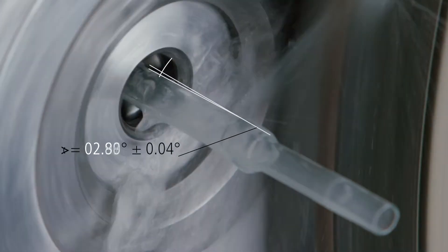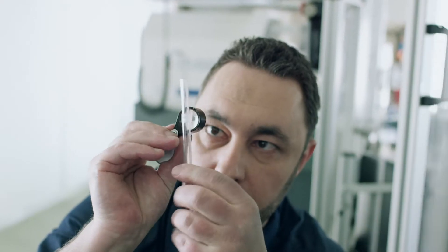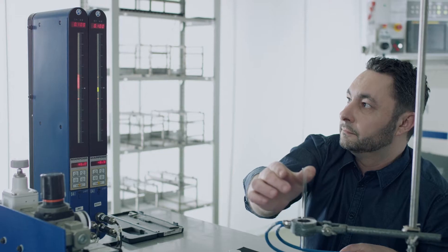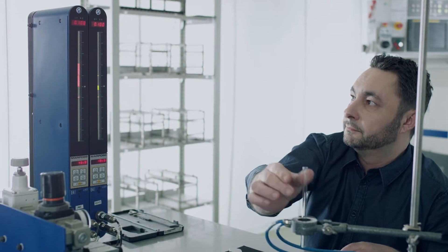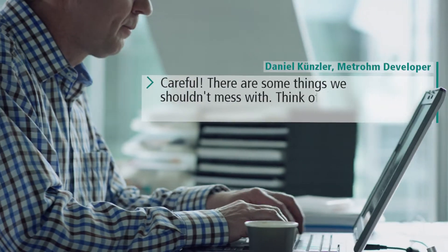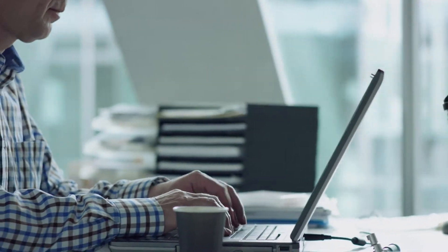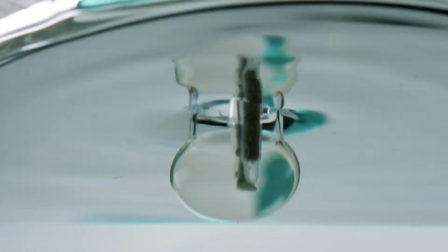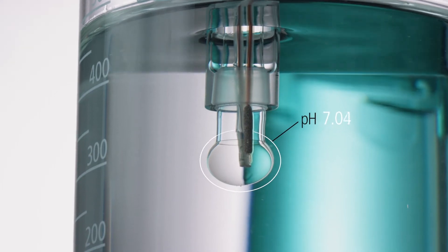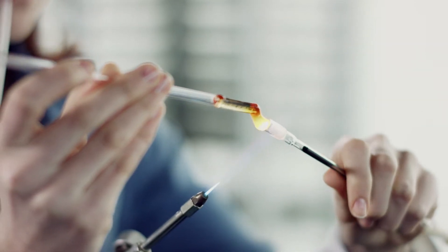In METROHM PH sensors, quality means attention to detail. Details like the unique precision with which we grind the diaphragm into the glass shaft of our electrodes. The result is superior accuracy and reproducibility of the results that our sensors produce. That's one reason why METROHM PH sensors are among the best in the world.